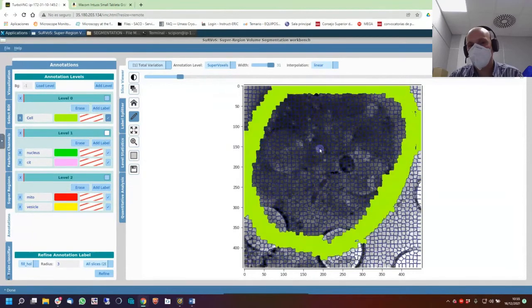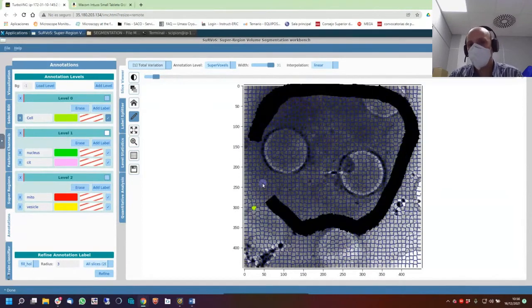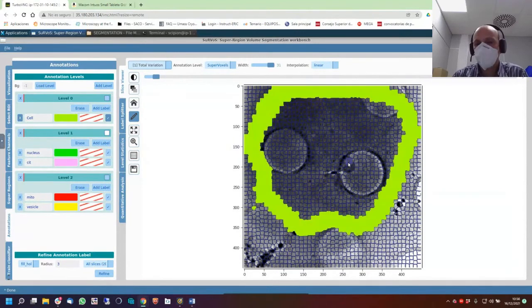And mostly the cells. And now it's where the interpretation is. You need to interpret it. There's a mitochondria here that is more or less in the same plane as the nucleus. It will not be possible. But we know that we have a missing wedge problem, and missing wedge means in real space that the features are elongated. So this is cell, yes. So for the moment, it doesn't matter. But when we try to select the nucleus, we will see that we'll have troubles.